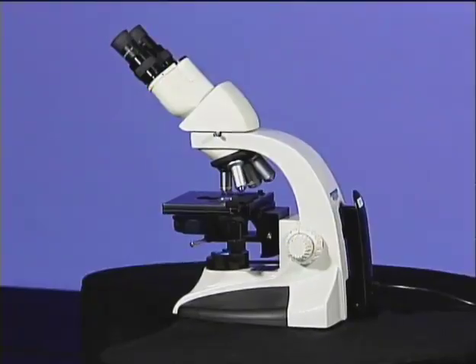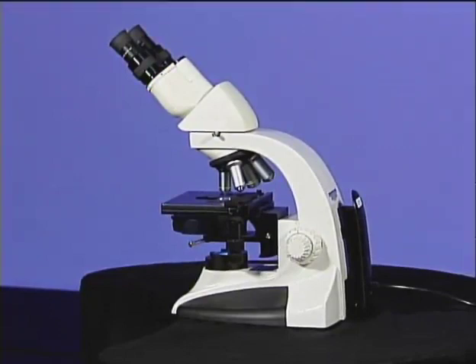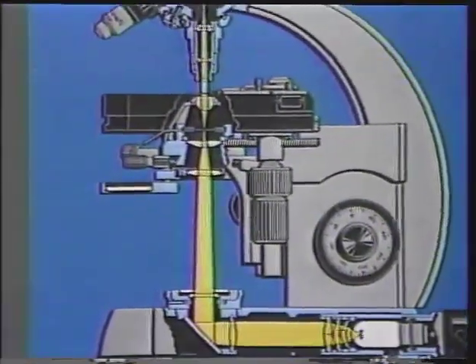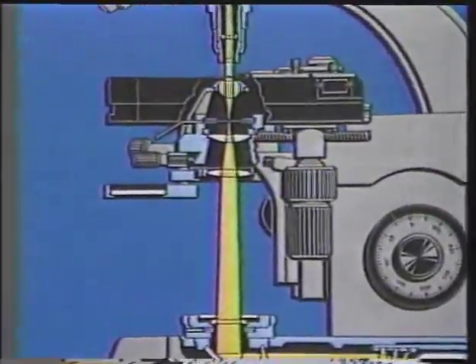Let's follow the path that light takes through these lens systems. Light from a light source is concentrated by the condenser, passes through the specimen, and then through the objective, forming a real image of the object.